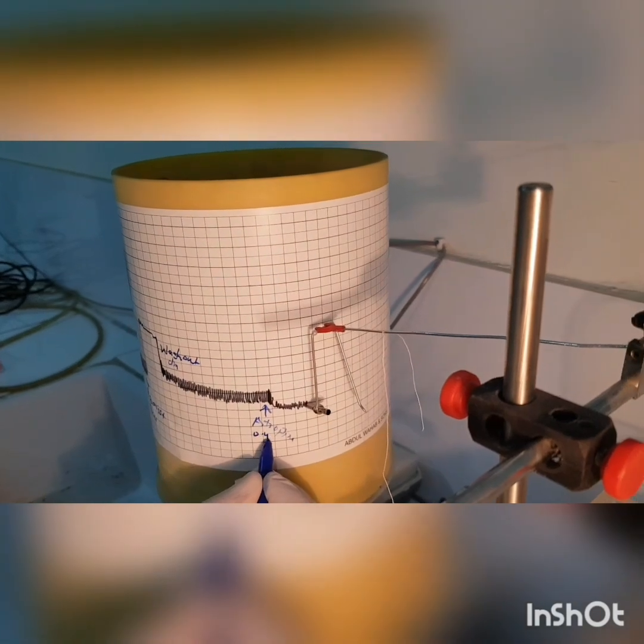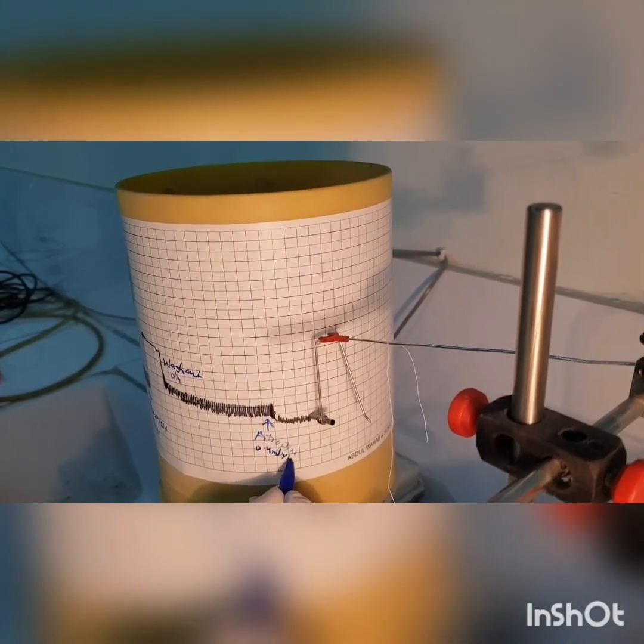The dose is 0.4 ml into 10 raised to power minus 5.